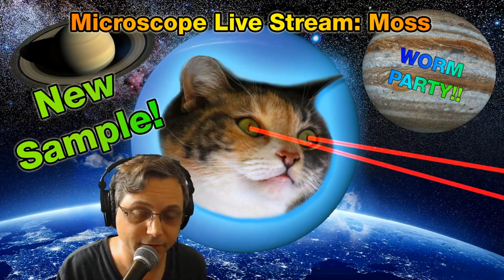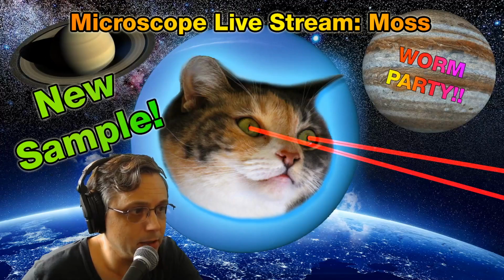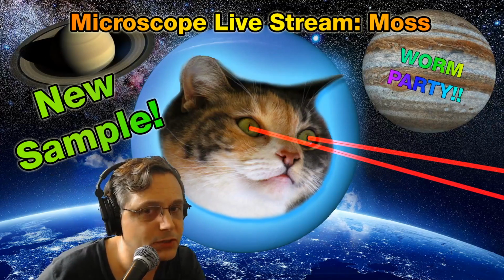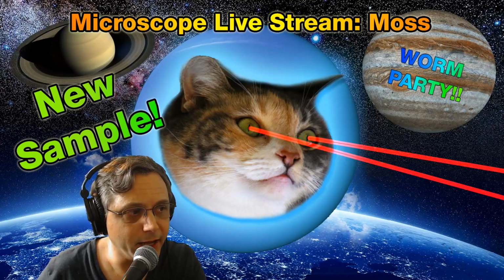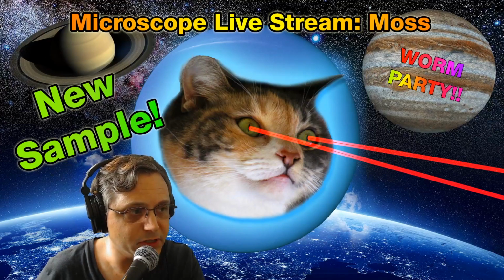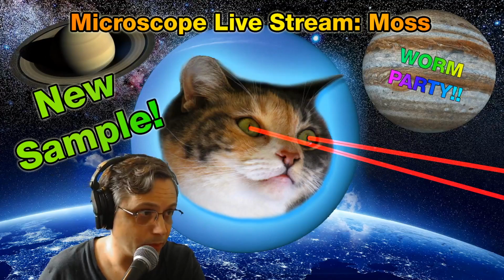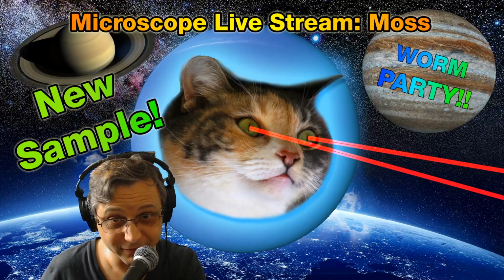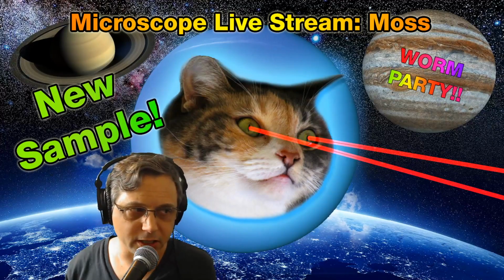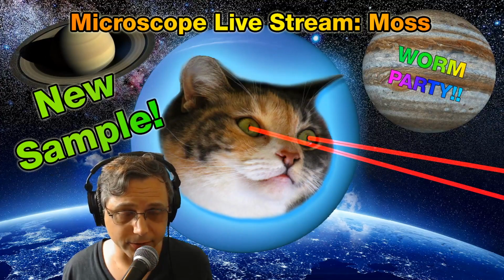But I'm going to start off with a slide that I prepared. This is the sample from the tree moss that we collected yesterday, and I put it on a flat slide with a cover slip because I want to see if we find any rotifers in here, and we can look at them under the microscope under the third objective at 1,000 times magnification. And by the way, we just ordered a little kit so we can do the oil, because we got the oil lens too, which I need to put back up on the microscope here.